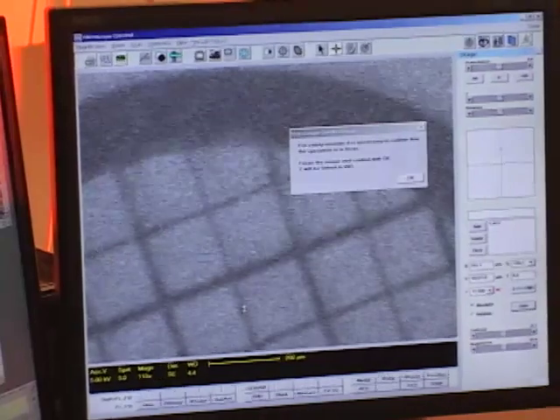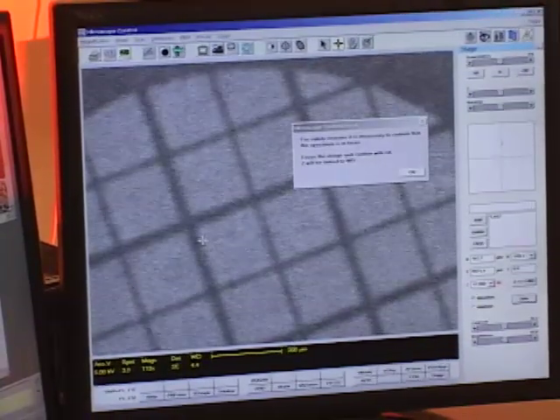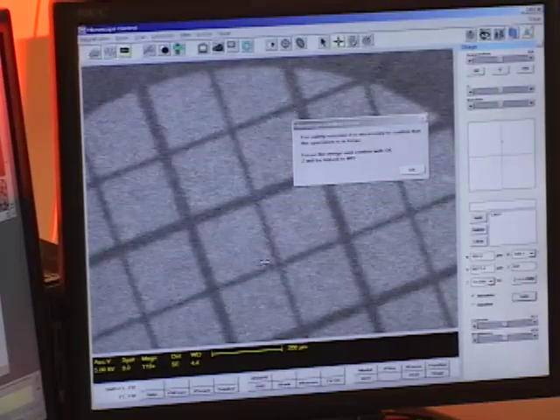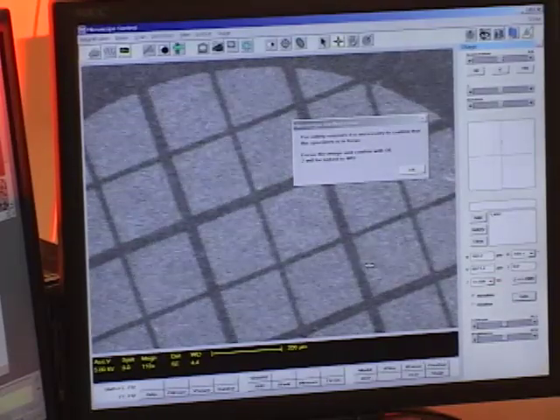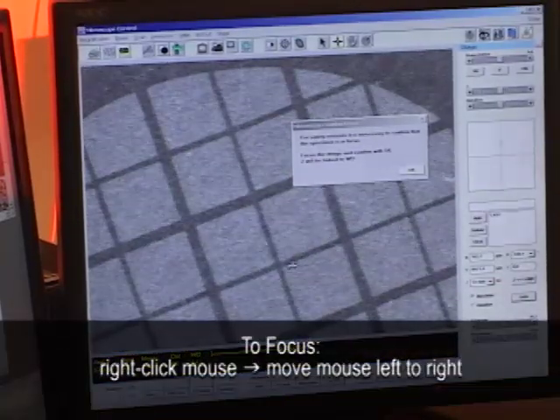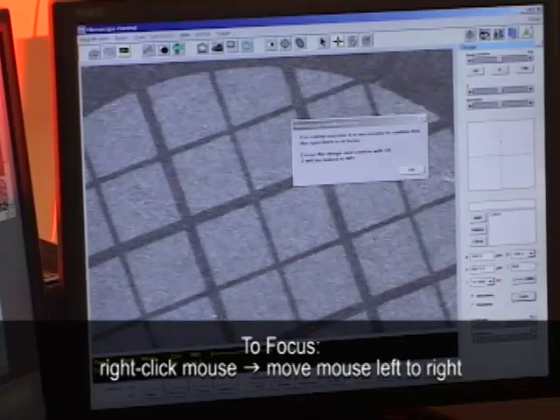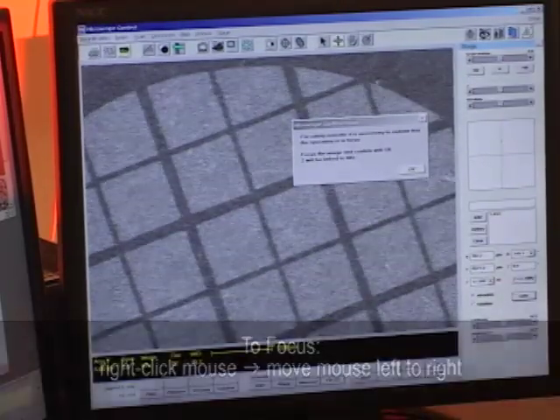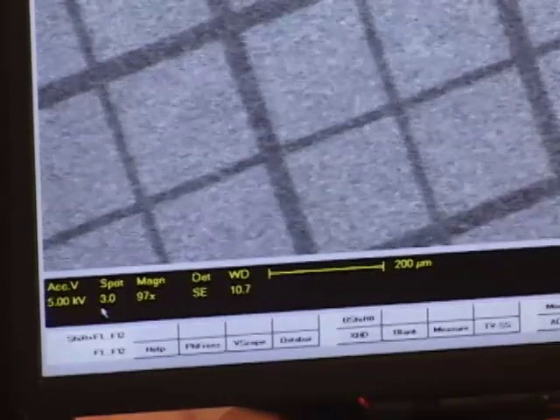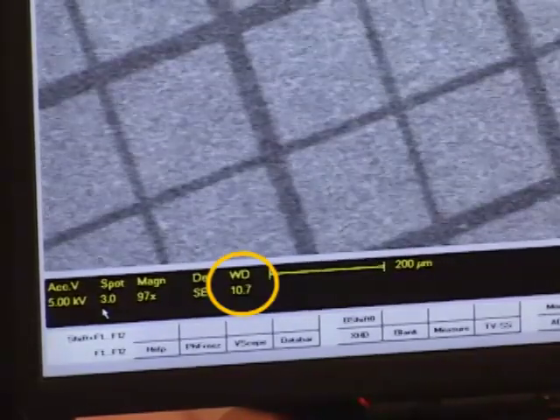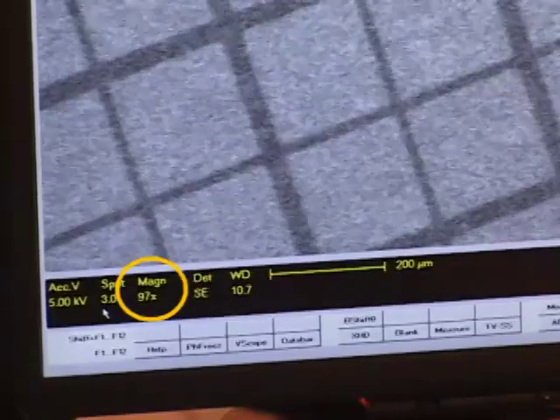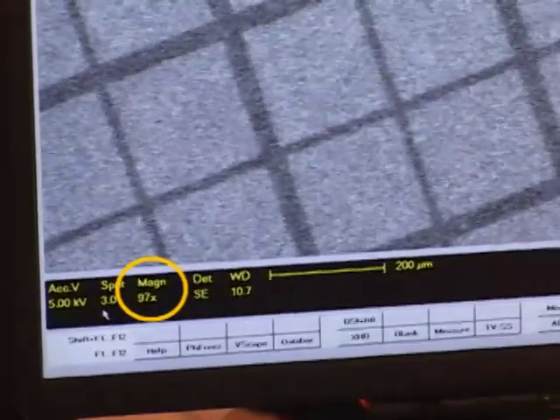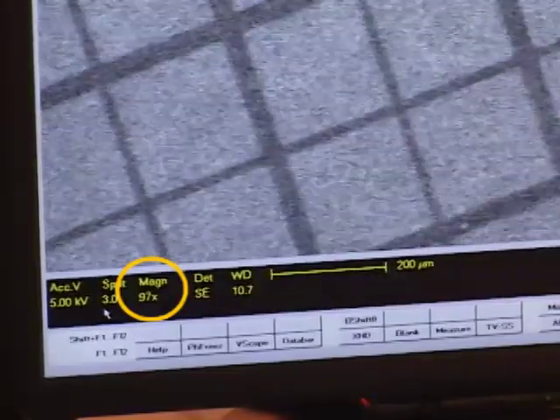The gold on carbon sample is located up here on the positive y-axis, so I'm actually going to move to the center of that sample and that actually gives us something to see. I'll focus this by right clicking the mouse and just moving left to right until I get the sharpest image. Now the sample is much more in focus than it was and you see the working distance reads 10.7 millimeters, but the magnification is only 97x. I need to get it in focus at 2000 or greater.